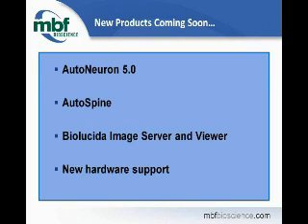So if you have images scattered across multiple hard drives in various networks, and finding them and keeping track of everything is difficult for you, Biolucida is meant to give you the opportunity to keep all of your images in one easy to manage place so that you can share those image data with your colleagues across the hall or across the world via the internet, and also do analyses on them in Stereo Investigator and Neurolucida. Yeah, there's a tight integration to our applications.